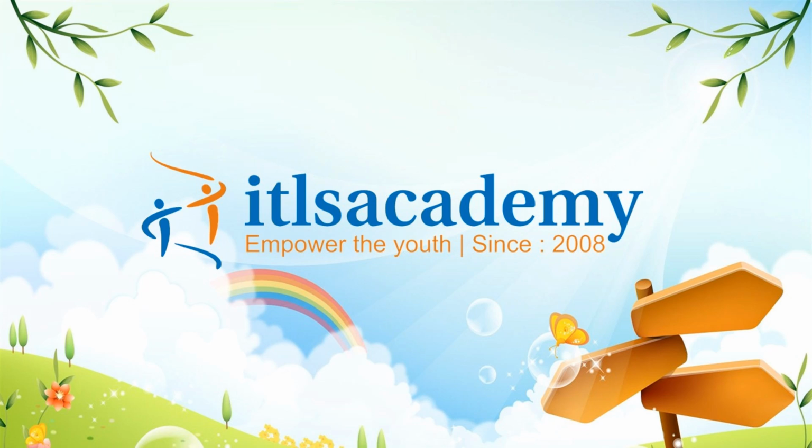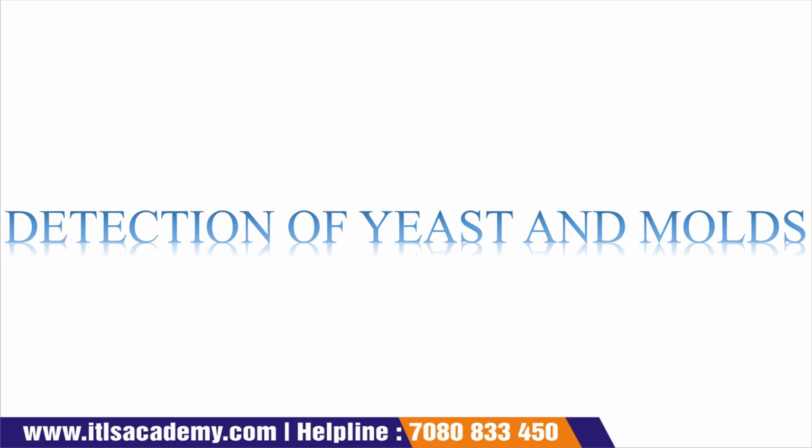Today we are going to discuss the detection of yeast and mold. Why is it important to detect yeast and mold in a water sample? Because when we are detecting something, first of all we have to know the importance of that experiment.